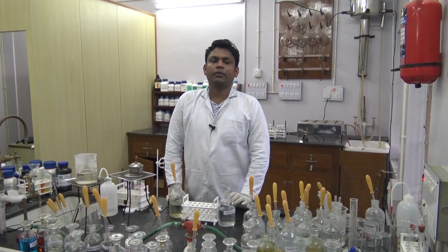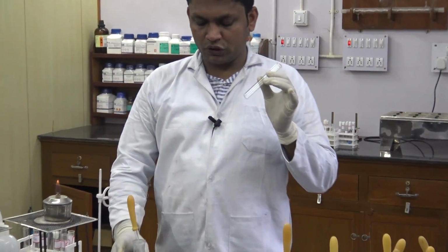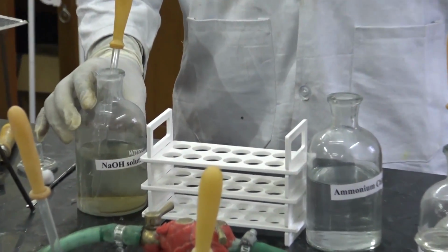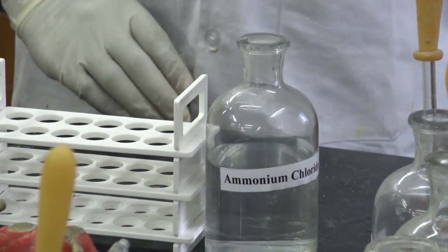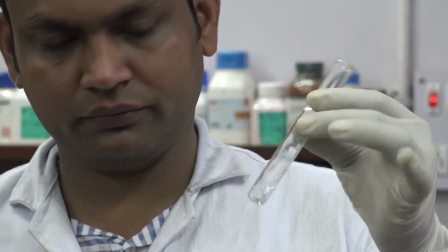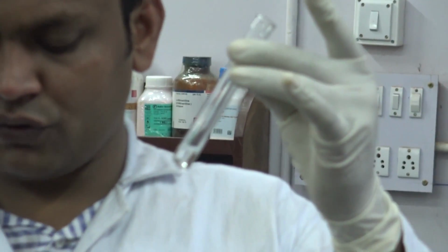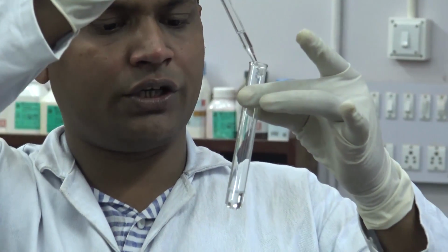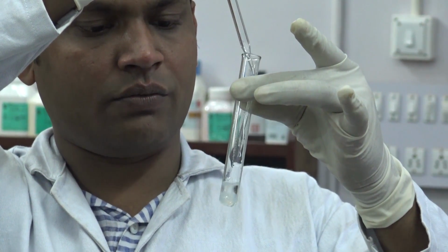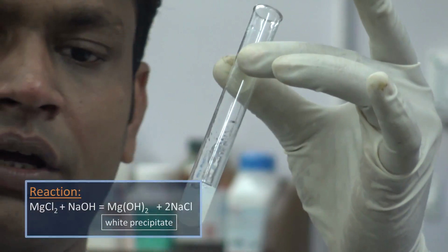Now we will perform the confirmatory test for magnesium, that is sodium hydroxide test. For this test we need sample solution and sodium hydroxide solution. Now for this reaction we have to dissolve this sample into distilled water. After dissolving the sample into distilled water, add few drops of sodium hydroxide solution to it. Formation of white precipitate. Here we can see white precipitate is formed. Formation of white precipitate confirms the presence of magnesium.